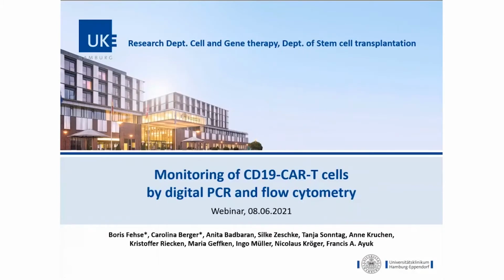So my topic is monitoring of CD19 CAR T cells by digital PCR and flow cytometry.